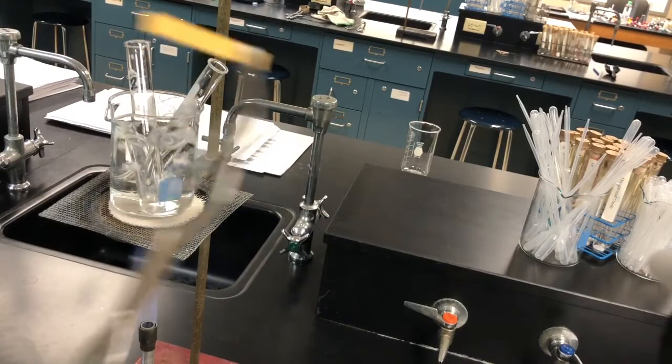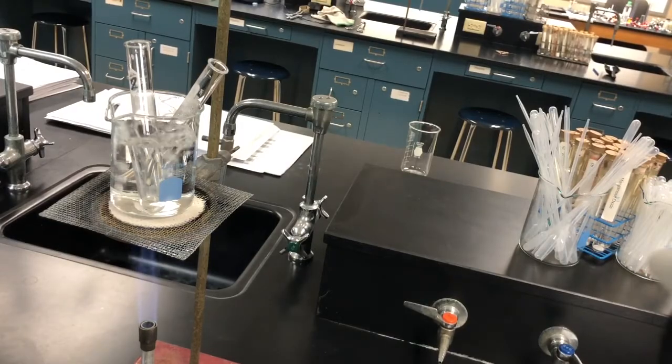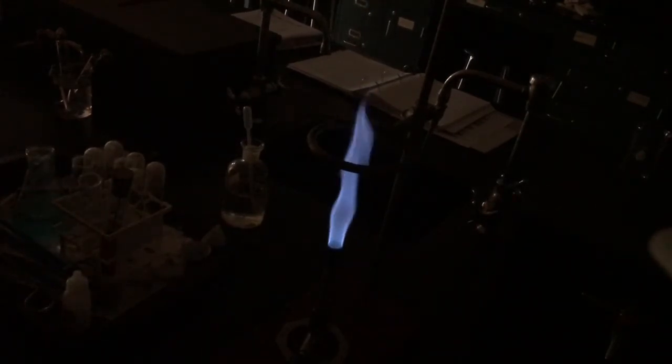Okay, and it's not turning blue, so we know that it's negative for the ammonium ion. Next is going to be dealing with the flame test, and this is actually one of the cooler parts of lab.